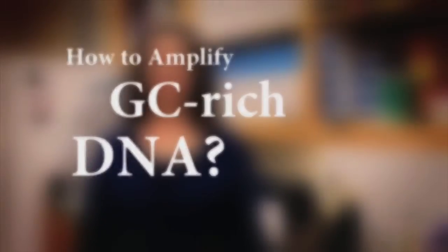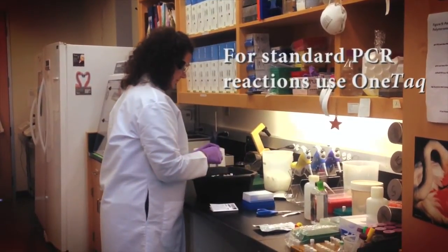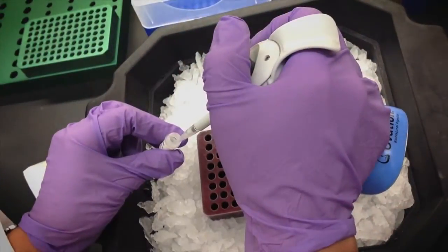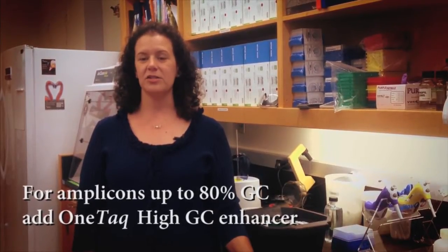Amplification of GC-rich DNA targets can be difficult for most traditional polymerases. For standard PCR needs, OneTaq DNA polymerase was developed with both standard and GC buffers to provide high yield and specificity from AT-rich through to moderately GC-rich targets. For particularly difficult amplicons, up to 80% GC, the OneTaq High GC Enhancer should be added to the GC buffer.